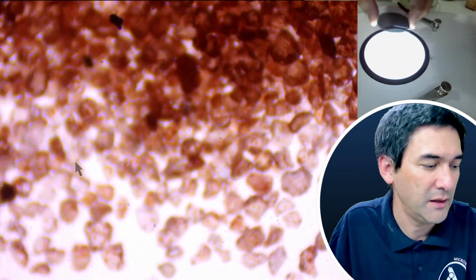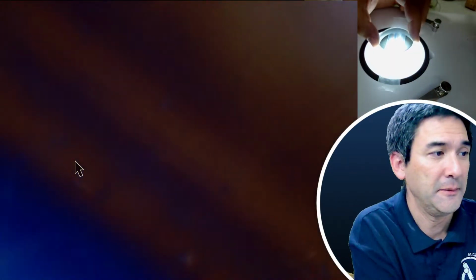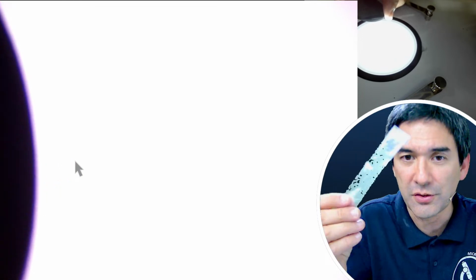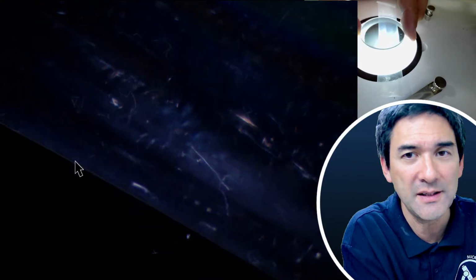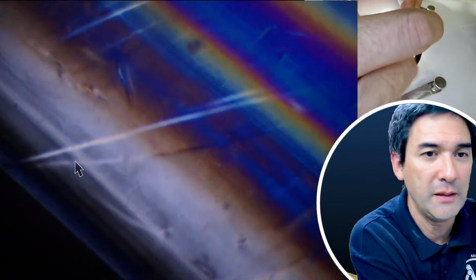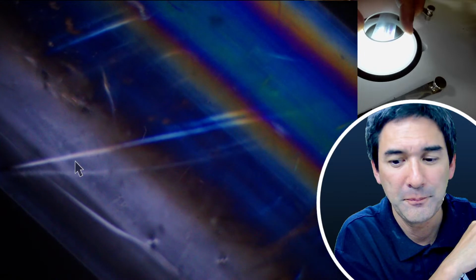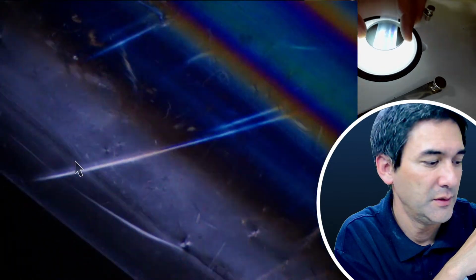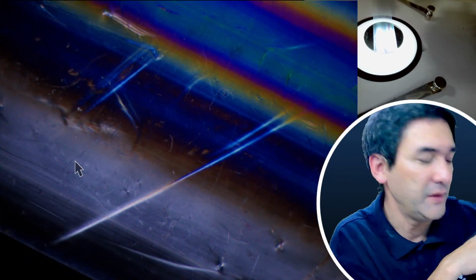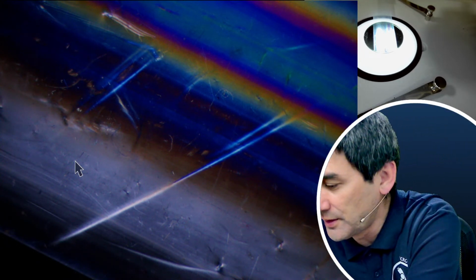Yeah, so this is kind of the thing. I don't know, theoretically, you can also do this with plastic. Look, this is the plastic foil for the tweezers. It's a well-known thing that some plastics produce these rainbow colors as well, because the plastic fibers are kind of aligned, and therefore they also polarize the light. So you can actually see even internal tensions. Okay, let's try this one over here.